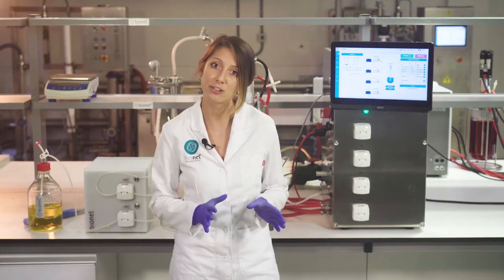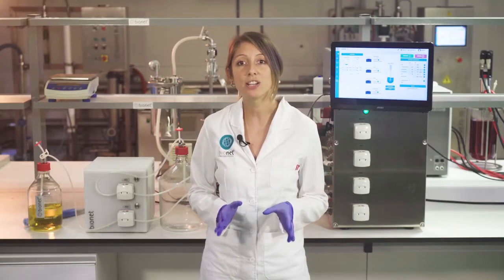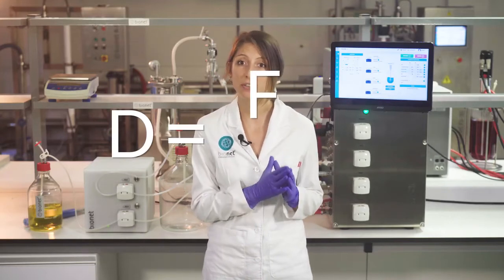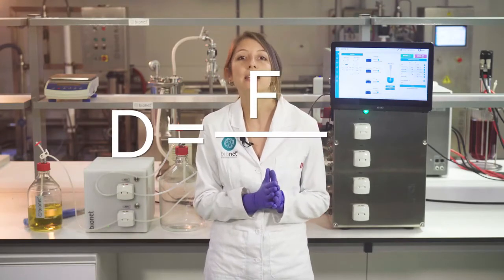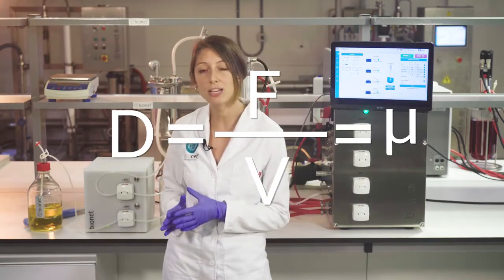This example of a process is using the chemostat strategy with a bacteria, and the product of interest are both the living cells and other metabolites in the supernatant. In the chemostat, the user needs to decide the dilution rate that will be used. The dilution rate is equal to the feeding or addition rate divided by the volume in the bioreactor, as well as to the specific growth rate according to the mass balance equation.